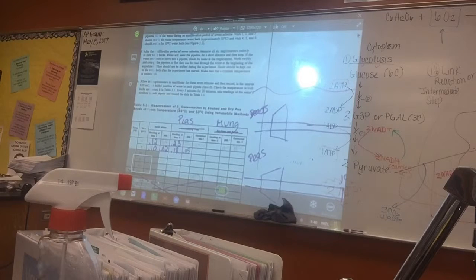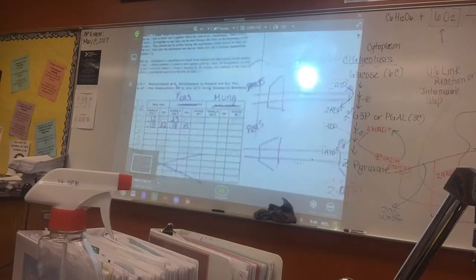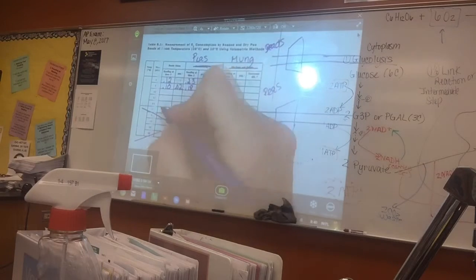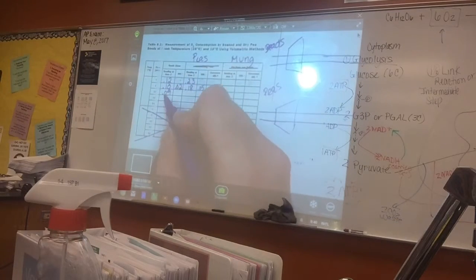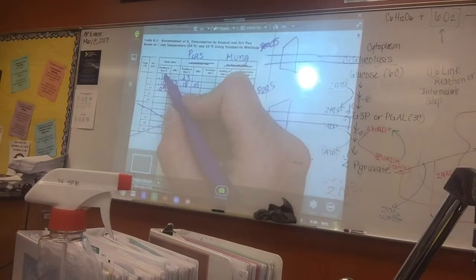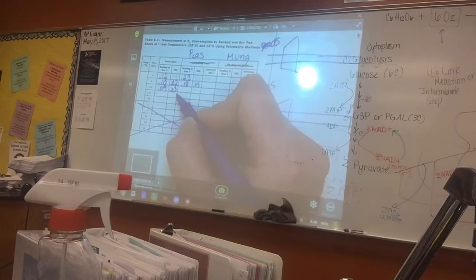Let me show you the data point. You're always going to do the difference, and it always goes back to your initial time. Let's say my next one was 0.09. So I go back to my initial, so here it would be 0.03, because it's always going back to your zero at time zero minus whatever time period that is. And so here it will be 0.03.